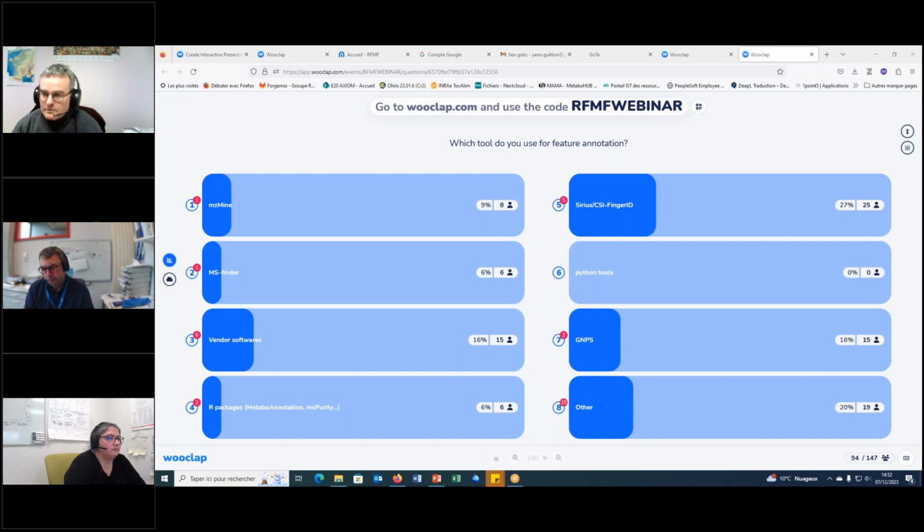So I would advise you to create sub-databases for each of your instruments before running the annotations, because sometimes in the huge aggregated databases we have a mix of GC-EI, ESI QTOF, ESI Orbitrap, all together, positive and negative modes. Sometimes it's mixed, so it's really important to be able to create sub-databases before starting the interrogation.